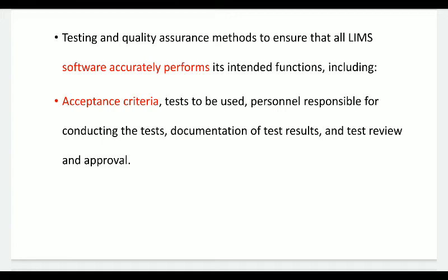You can also say that this is a kind of validation for the software which we have purchased to operate LIMS. During this validation, we have to work on acceptance criteria, tests to be used, person responsible for conducting the test, documentation of test results, and test review and approval.